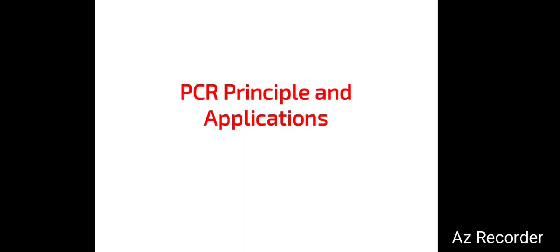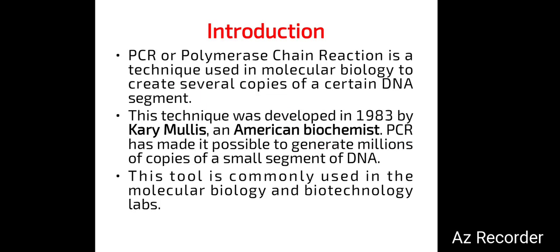Hello everyone. Today I am going to present an important molecular biology technique called polymerase chain reaction. It's commonly known as PCR. PCR is a powerful laboratory technique used to amplify, or make millions of copies of, a specific DNA segment.